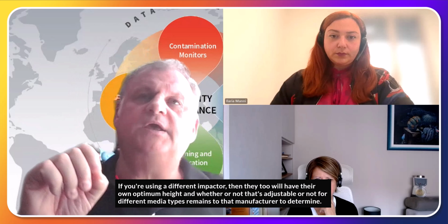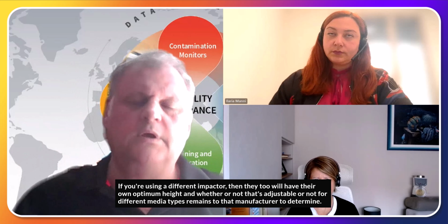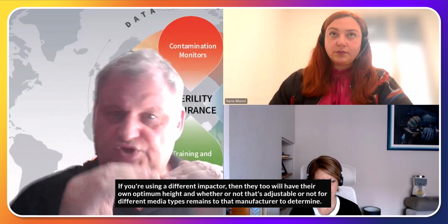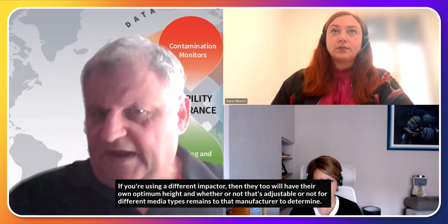If you're using a different impactor, then they too will have their own optimum height, and whether or not that's adjustable for different media types remains for that manufacturer to determine. So some that I've seen can be a few millimeters, some of them look a little bit odd because they're nearly a centimeter.